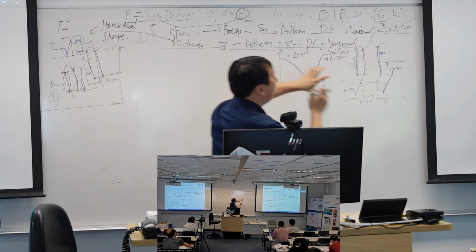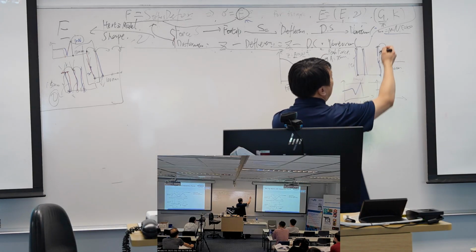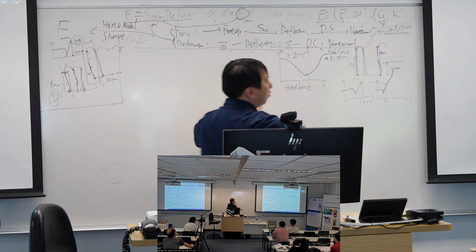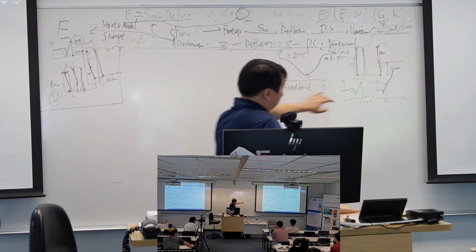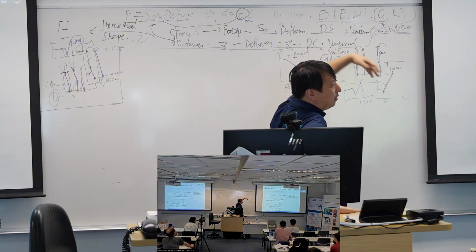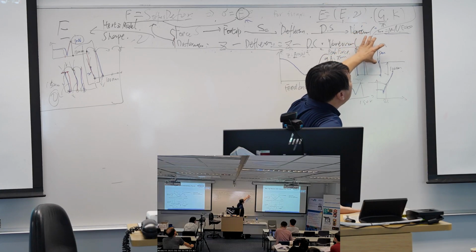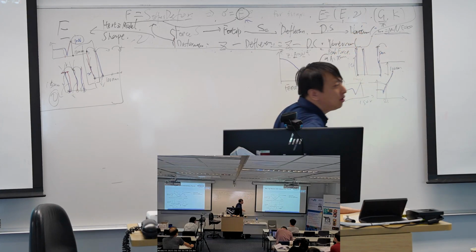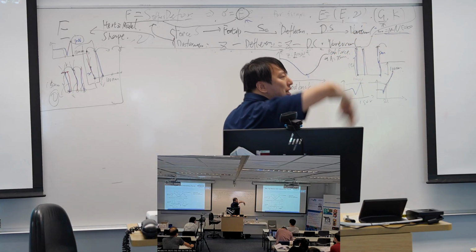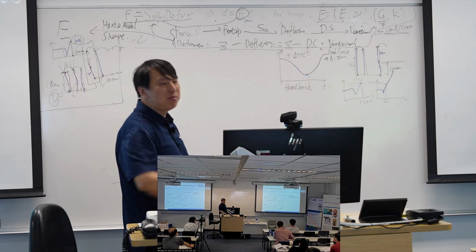My whole idea is I want my force to be set at 1 nanonewton. But if the height of my surface increases, and I still want the force to be 1 nanonewton, I have to lift my probe. Right? I have to lift my probe.